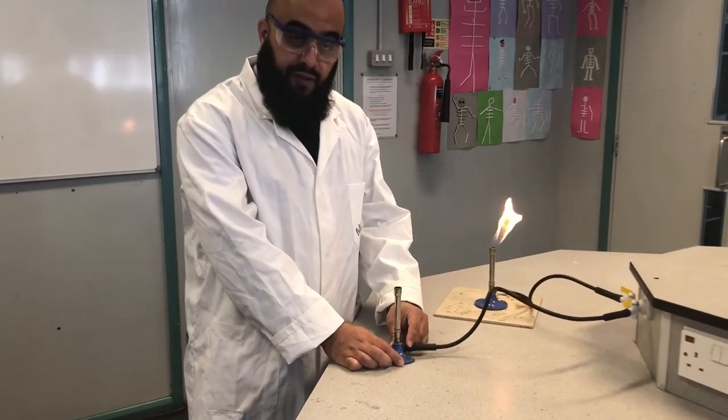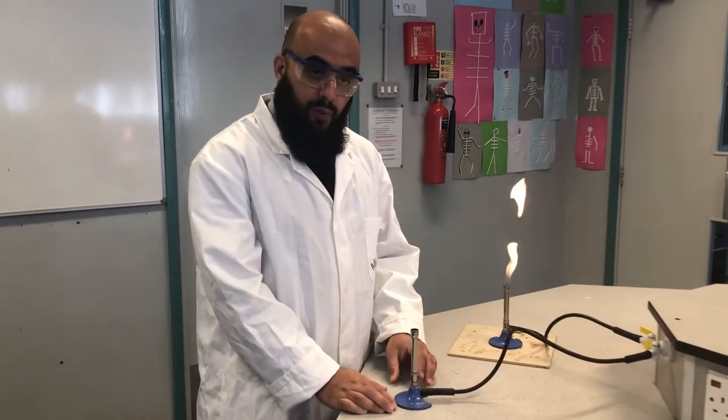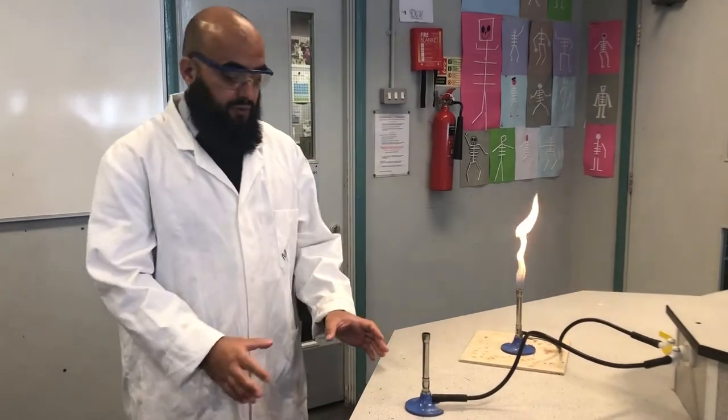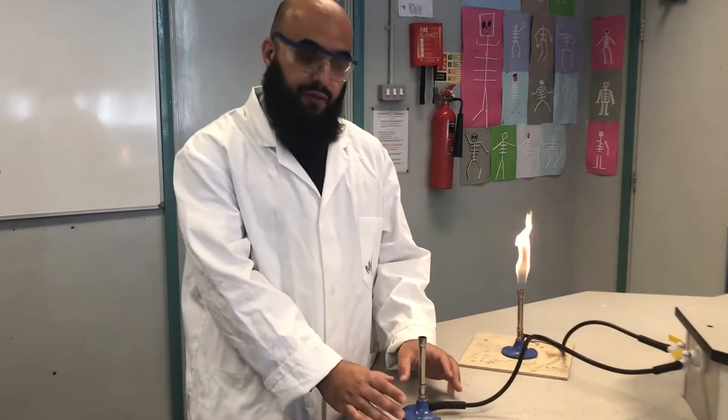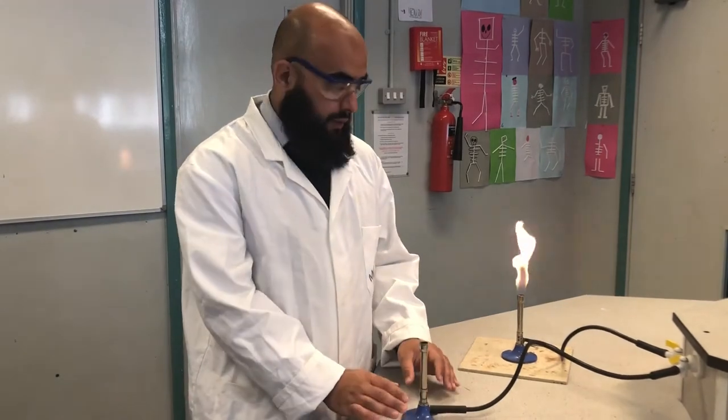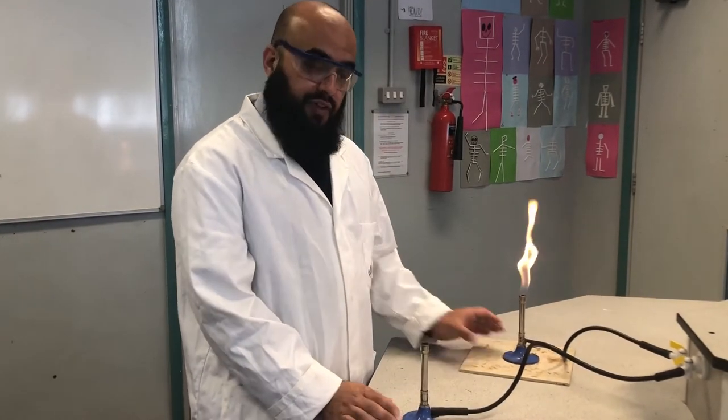Hello, welcome Year 7 to Science at Harrow High School. We're going to be working with the Bunsen burner today. I'm just going to be demonstrating a little bit about how this crucial piece of equipment works and also how to use it safely.